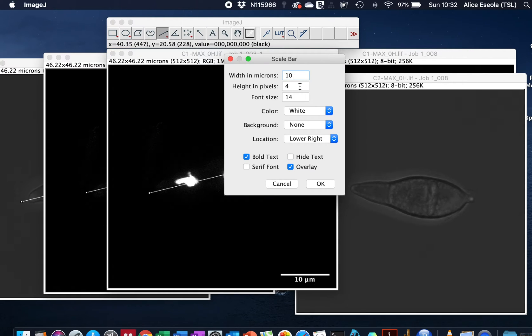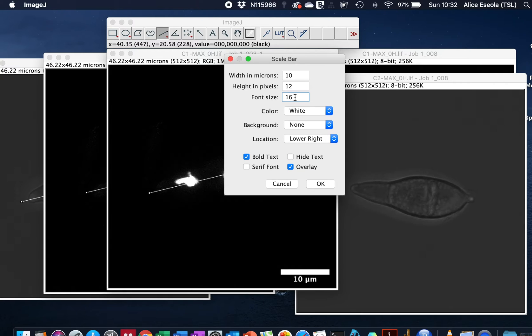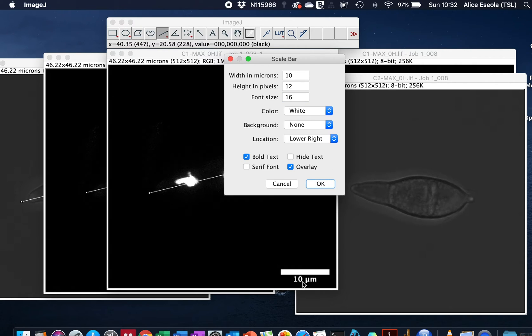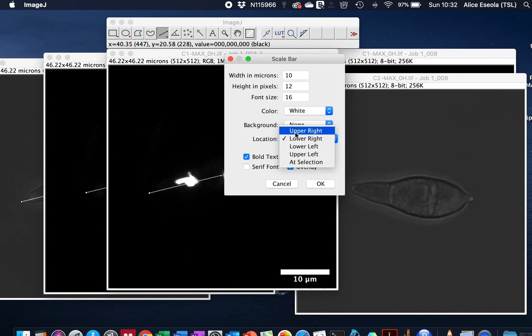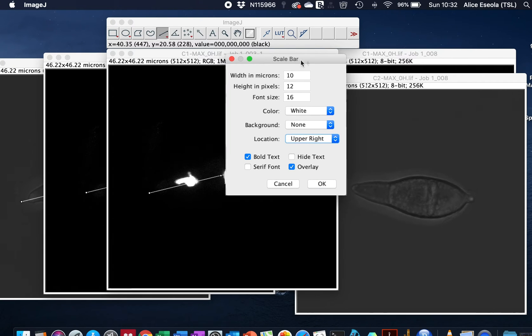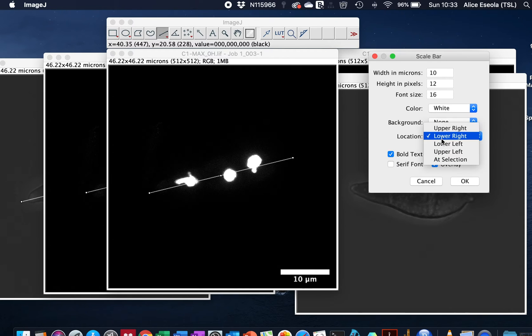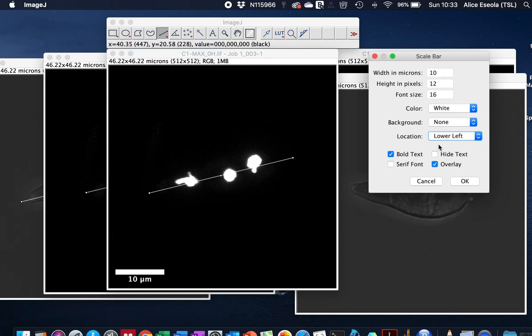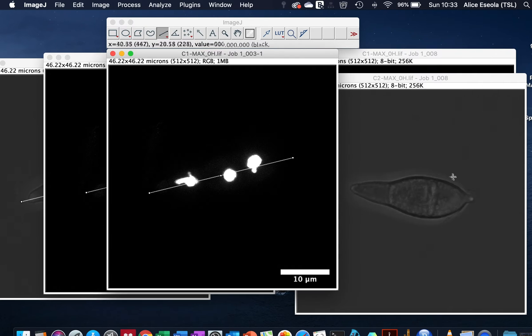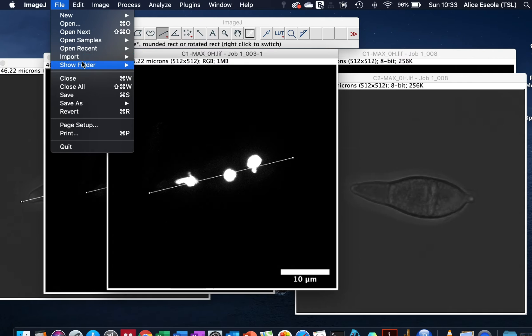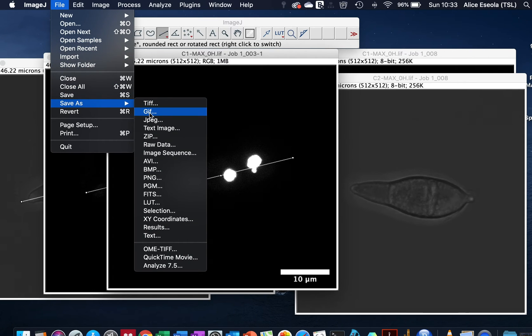Now we'll be adding a scale bar to this image as shown before, using 10 microns. We're going to increase the height of our plot to 12 and we increase the font size to 16 to match the font with the graph. Also you can decide which direction you want your scale bar to be - upper right, lower right, or lower left. I will leave it as lower right and save my file as a JPEG for final use.